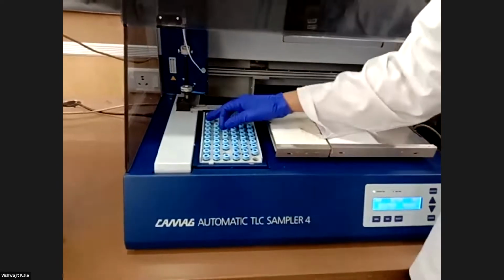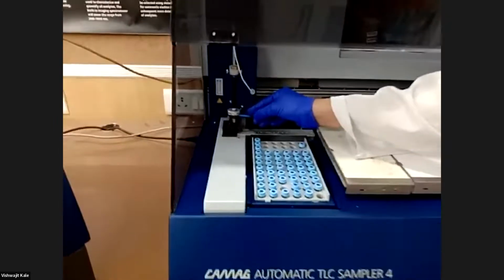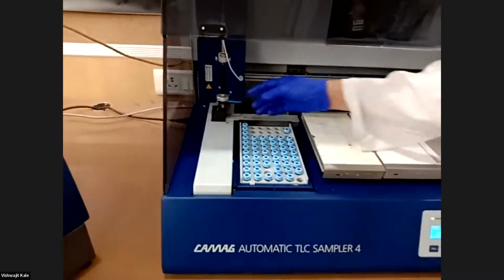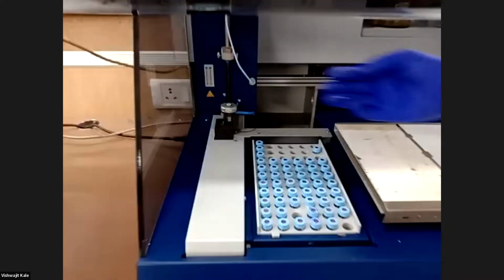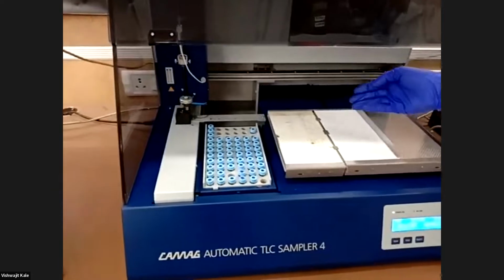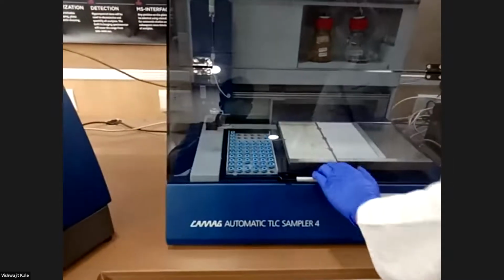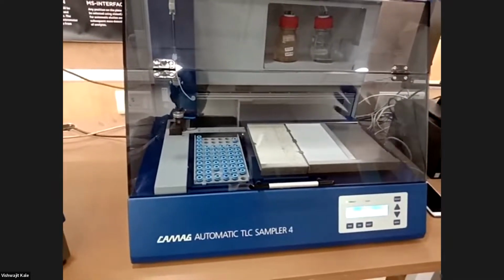So we have kept the samples and standards over here, and this tubing is coming from the compressed air we are using in our lab. We can use nitrogen gas also, which will remain neutral during application. By using this gas pressure, the syringe will generate a very fine spray, and that spray will fall onto the plate in the form of bands. We are applying the samples, and it is a contactless application by using the spray-on technique. So this is all about the sample applicator in HPTLC, the CAMAG ATS4 automatic TLC sampler.